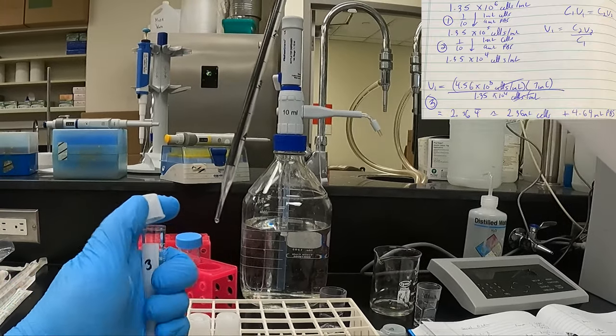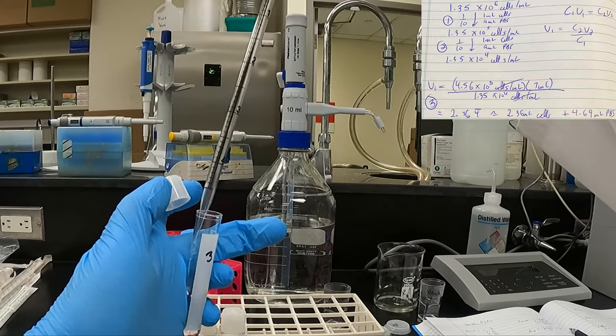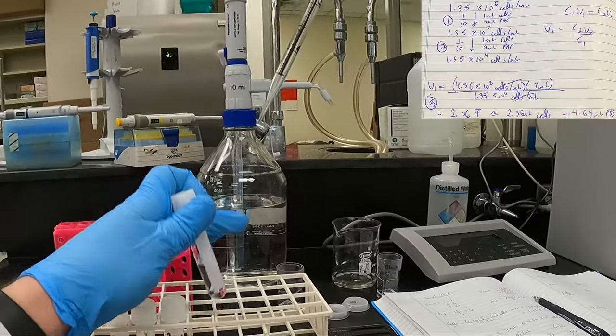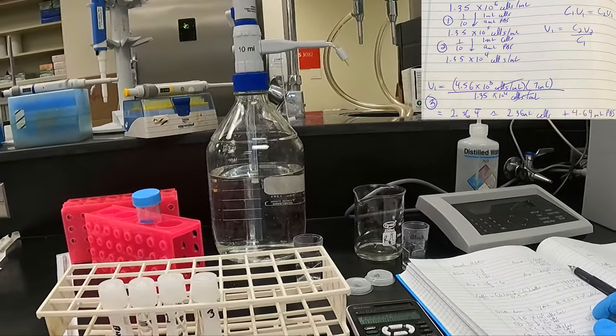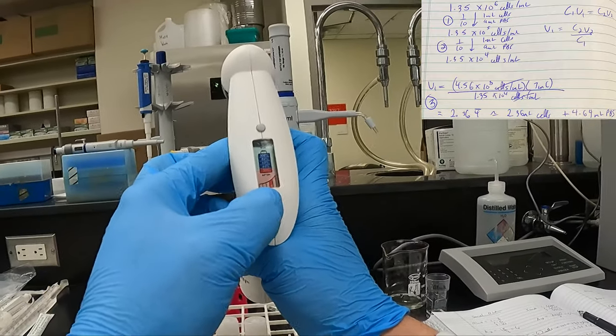Make sure you're at eye level. Load that into tube number 3. Okay, we have all of our solvent loaded into the 3 tubes. Now we're going to do our dilution with our cells.